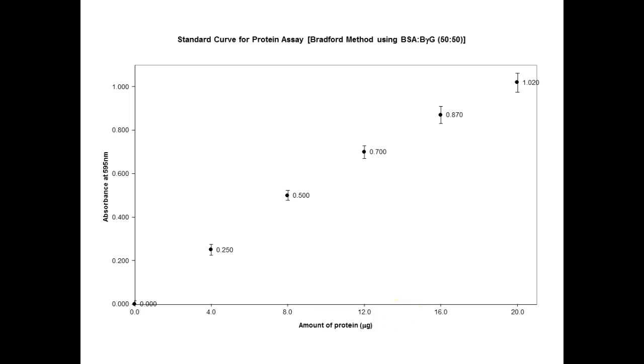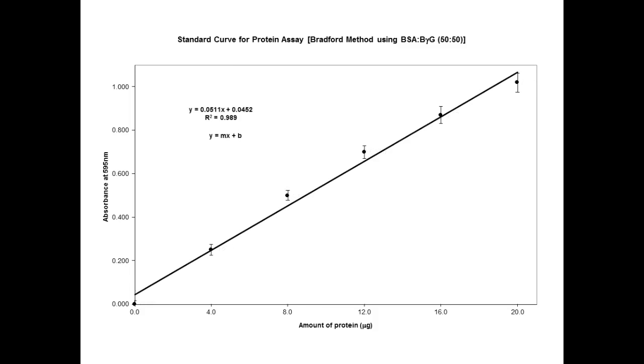And so we would plug these numbers into a computer, into a program, and it would help calculate, right? We could do a linear regression, which, as you notice, they're not all lining up, right? Or we can do a little bit more complicated math where we can take into account all the points, and make the line match up to all the points. And of course, depending on which you do, your values are going to vary differently, right?